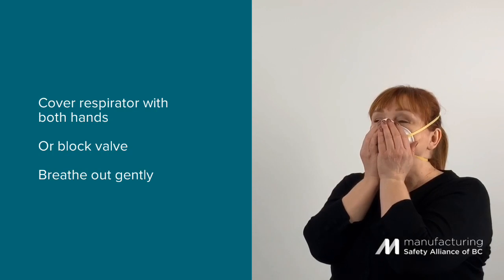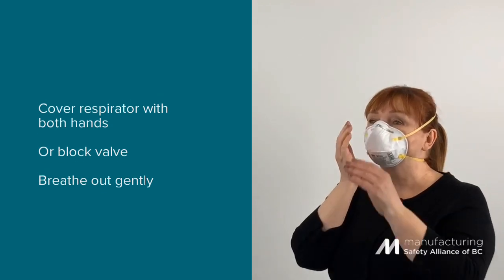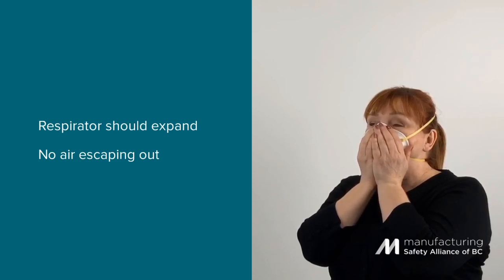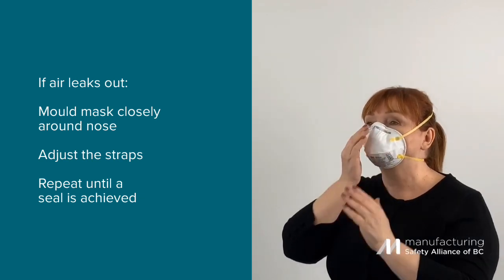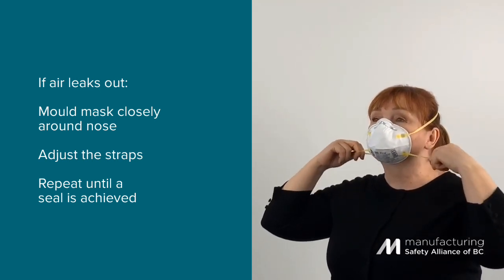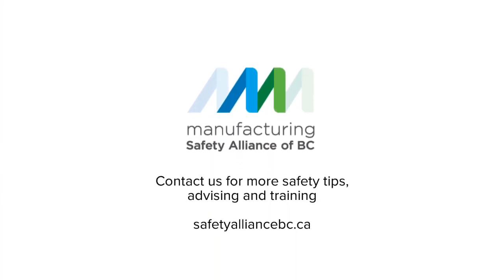Place both hands completely over the respirator. If there is a valve, lock it off by covering it with the palm of your hand. Breathe out gently. If you have a good seal, the respirator should expand slightly. You should feel no air escaping. If air leaks around the face seal, mold it closely to your nose and adjust the position of the straps. Repeat the test until a seal is achieved.